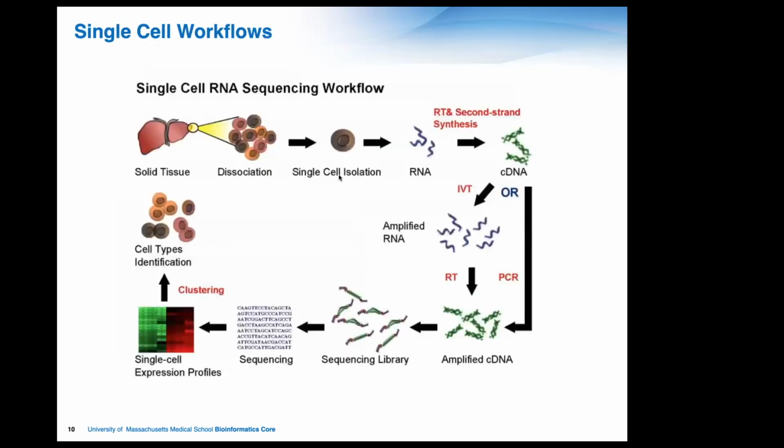So single cell workflows, again, there are many different technologies out there right now. If you have a particular question about a particular technique that you might have come across, feel free to ask, and I may or may not be able to give insight depending on if I've used that method before. But they all follow a core set of principles where you're going to take your solid tissue, I guess it could be cell culture to start with, and you're going to dissociate that into a single cell suspension.